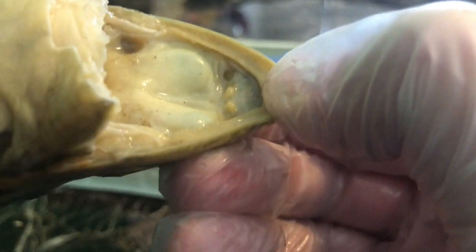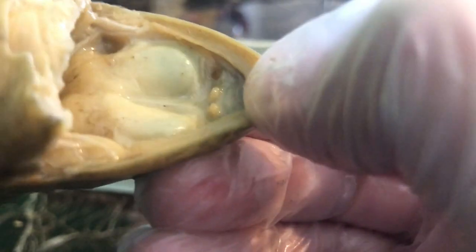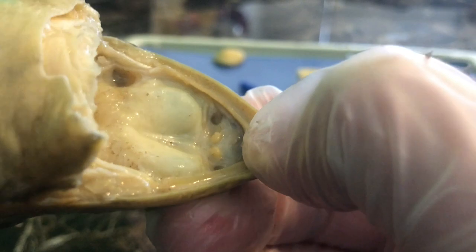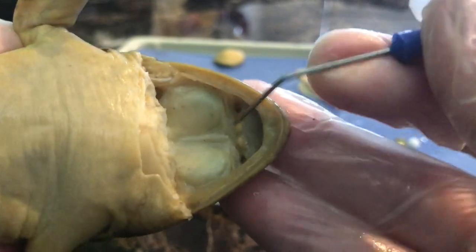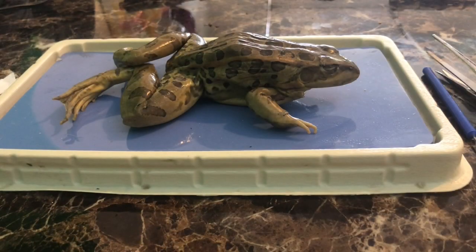You are responsible to know both sets of teeth. These teeth are not necessarily for chewing, but they do help hold the prey as the frog swallows it whole. We have the two internal nares and then the external nares on the outside.